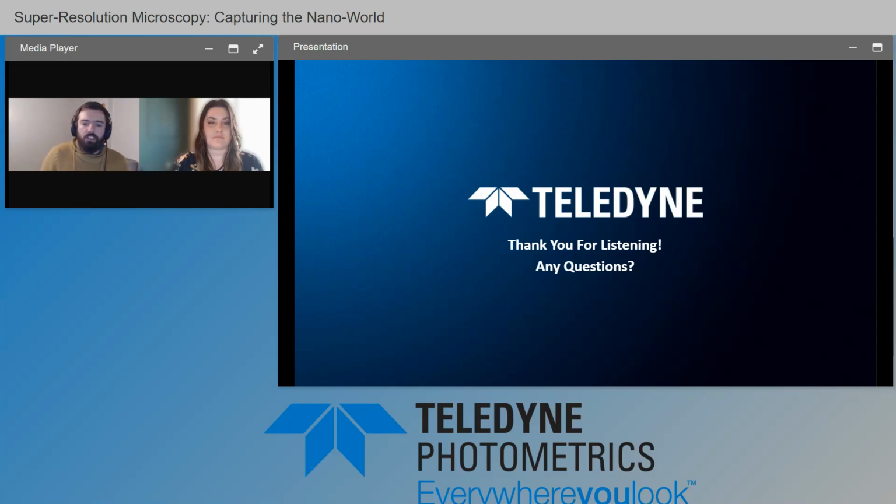So if you wanted a sub-assembly that you could just add onto your system and then make it a super resolution system, it'll have to be super resolution methods that are based around the way the microscope works, as opposed to the way the fluorophore works. So there's definitely some solutions for things like SIM. Solutions for things like STORM may exist, but I'm not sure. As for the confocal microscope, you can convert it into a super resolution confocal microscope with the micro lenses. But there's also systems like the Yokogawa SoRa and things like that. They do super resolution with a spinning disk. So to answer your question, yes, you can have some sub-assemblies that give you super resolution, but not others, essentially.